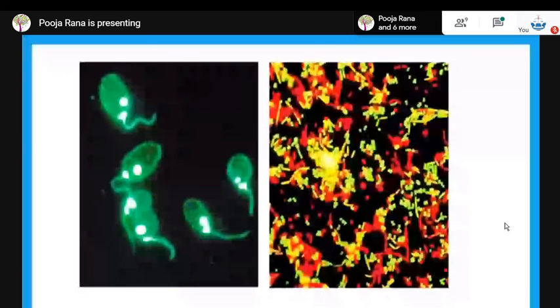Second thing is the magnification of comparison microscope. The magnification can go to the level of 1,000 times, provided you use the combination of 10x at the eyepiece and 100x at the objective lens. And as low as 25 times you can magnify the image. So it totally depends upon what type of lenses you are fitting onto your eyepiece and your objective lens. Based upon that, you can attain the desired magnification, and it can go up to 1,000 times.